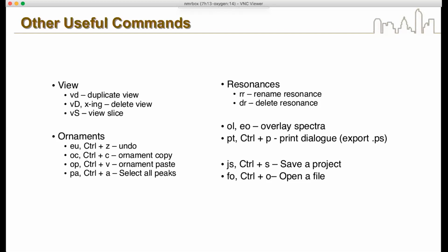Yeah, sorry. I was just going to ask, what is the difference between AL and ST for referencing? Yeah, actually, AL is interactive mode. So you can select one peak in one spectrum window and then another peak in another spectrum window. And then if you use AL to align it, and then if you open the ST window for that aligned spectra, then you will see actually the chemical shift made by doing AL. But if you just want to type the number, if you already know uniformly it will change, then you can just type using ST. So there are two methods that you can use.